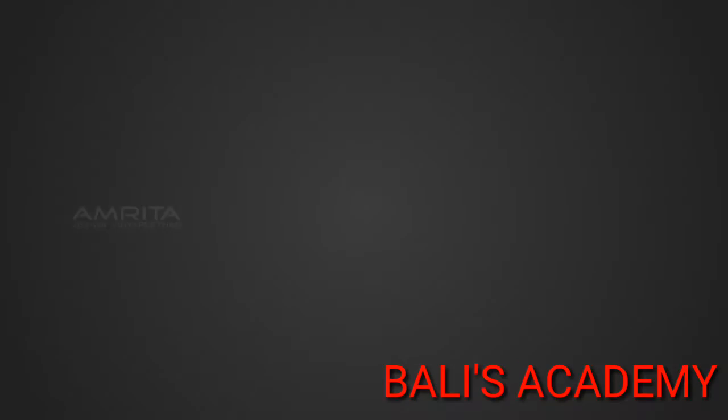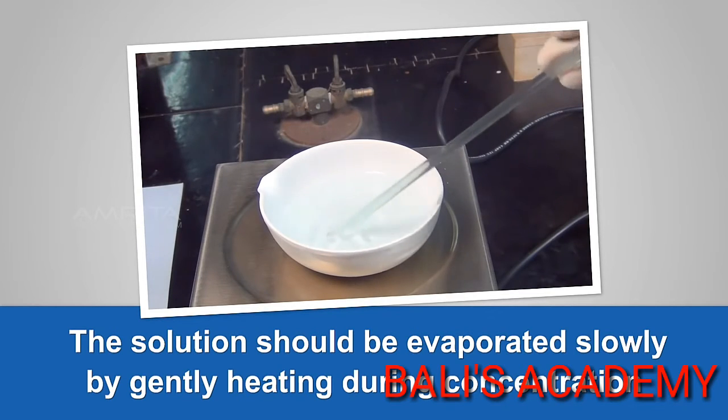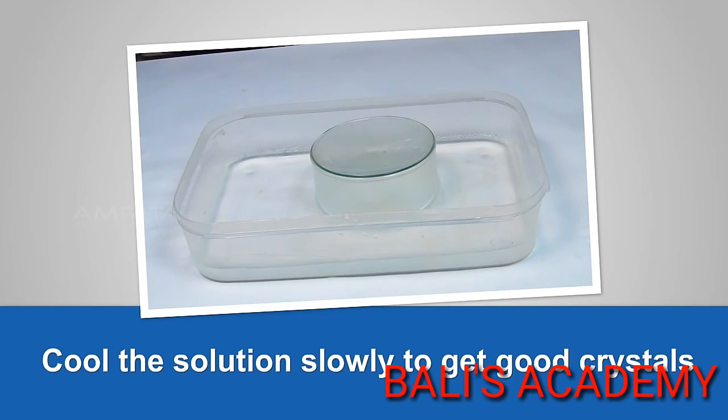Precautions: The solution should be evaporated slowly by gently heating during concentration. Cool the solution slowly to get good crystals.